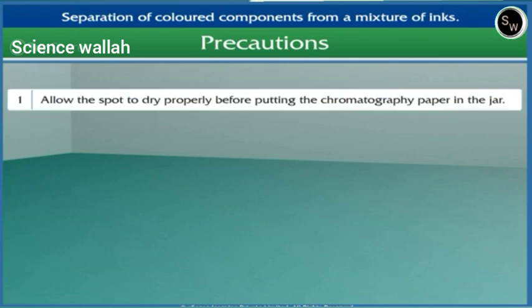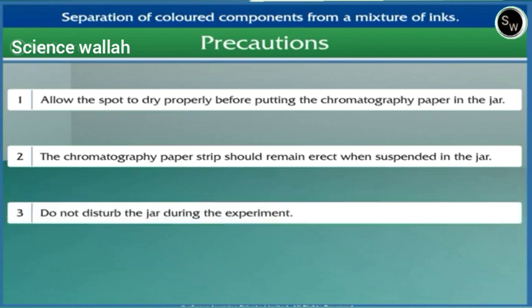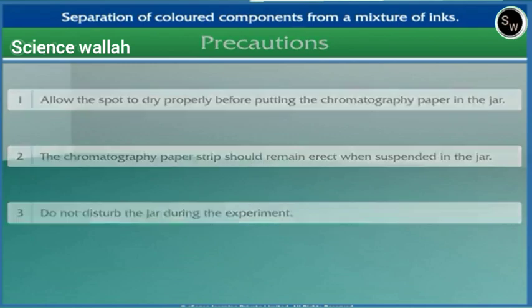Precautions: allow the spot to dry properly before putting the chromatography paper in the jar. The chromatography paper strip should remain erect when suspended in the jar. Do not disturb the jar during the experiment.